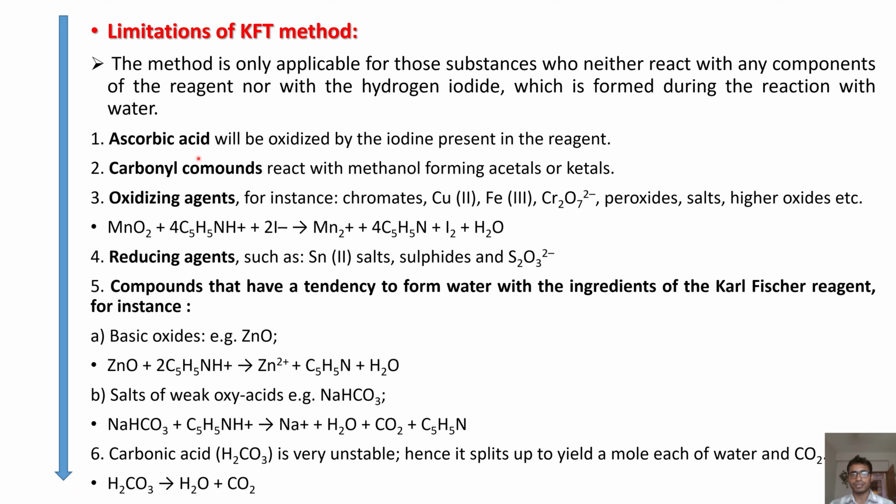However, there are some limitations of the KFT method. The method is only applicable for those substances which neither react with any components of the reagent nor with the hydrogen iodide formed during the reaction with water. Ascorbic acid will be oxidized by the iodine present in the reagent. Carbonyl compounds react with methanol, forming acetal or ketal.